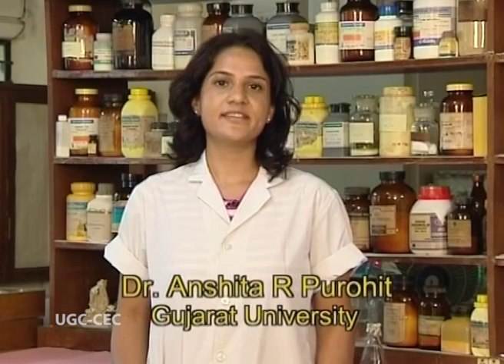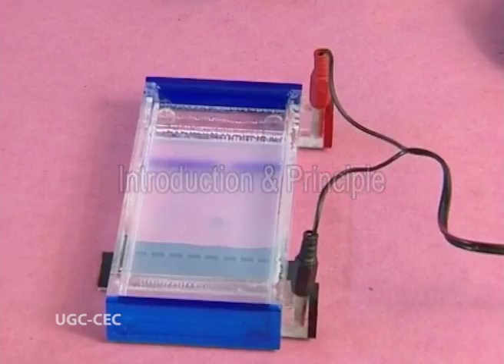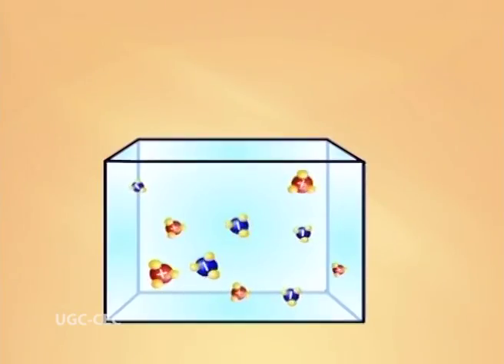Nowadays, various techniques are available for the separation of DNA, RNA, proteins, amino acids, peptides, etc. The most frequently used technique out of all the mentioned techniques is electrophoresis, as it is more conventional as well as diversified. The principle of this technique is basically based on the net charge of the ions, the molecular weight of the ions, as well as the electric current which is supplied externally.